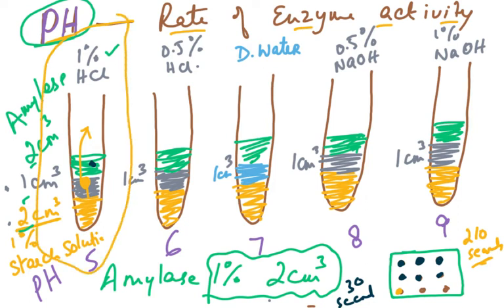Now you will mix the amylase, because I've just shown you the amylase, but I didn't mean that you should mix the amylase. So as soon as you mix the amylase, then you start doing this on the second test tube. Then when you've done that and you figured out how many seconds it took, then you do it with this test tube, and then you do it with this and this. So 5 pH, and the rate of enzyme activity has been studied by altering the pH.